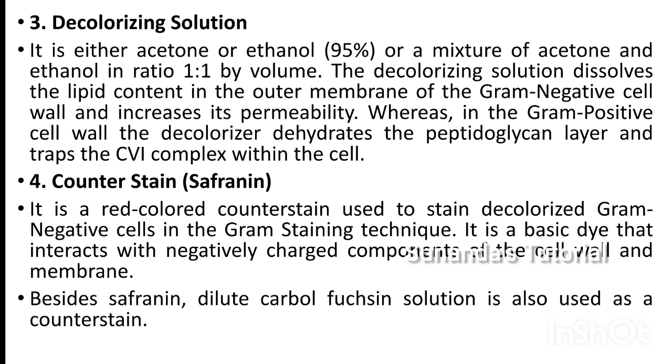It will only wash out the lipid content of gram negative bacteria. Then after washing out the lipid content of gram negative bacteria, they can retain the safranin or the counter stain, but gram positive bacteria cannot take the safranin or counter stain because they have a strong CVI complex formed.